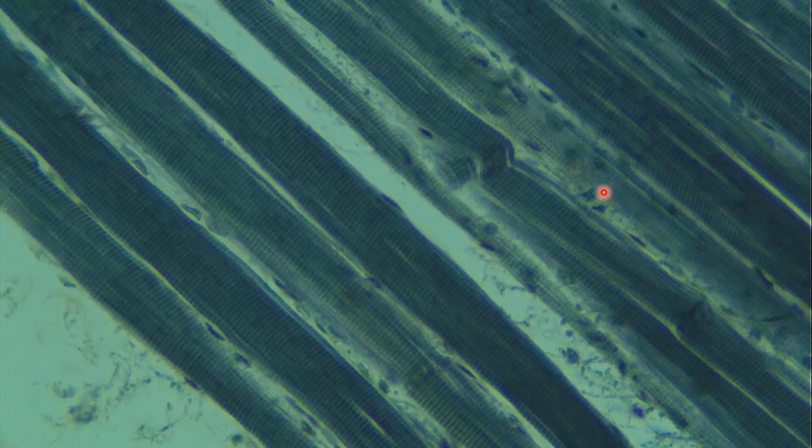These bands remind me of TVs back in the day when they would get out of focus. These are called striations. And these striations are one way to tell you that you're looking at skeletal muscle as well. So skeletal muscle is voluntary, so you can control the movement of it.